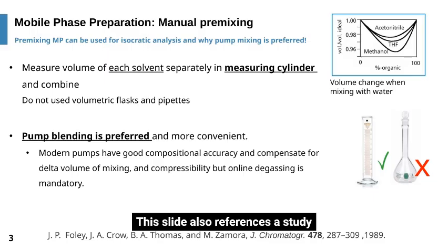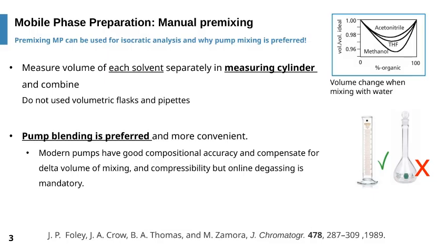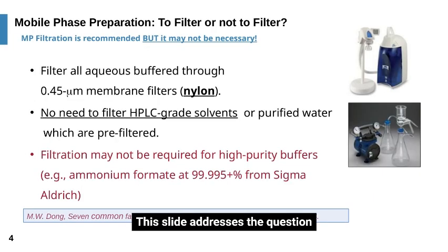This slide also references a study by J.P. Foley et al. on volume change when mixing with water. This slide addresses the question of whether to filter mobile phases. It recommends MP filtration but notes that it may not always be necessary.